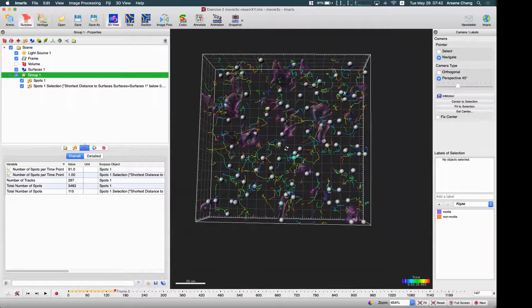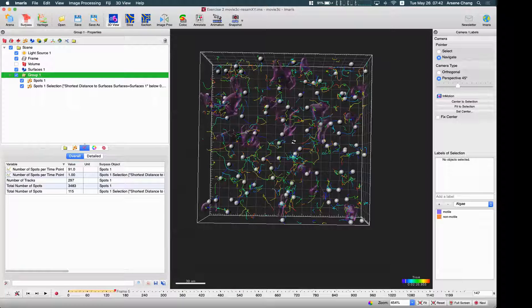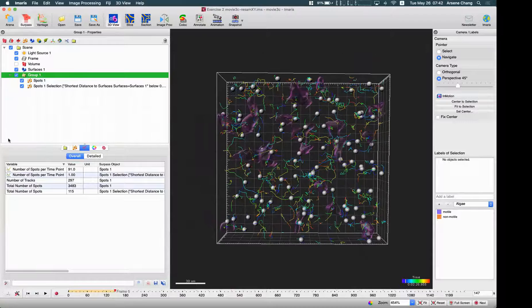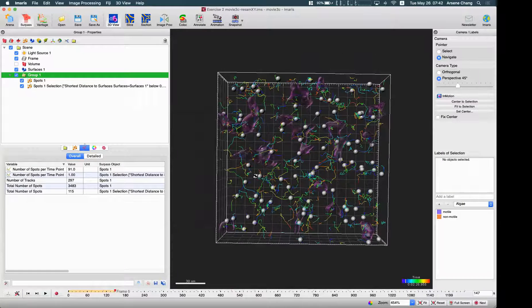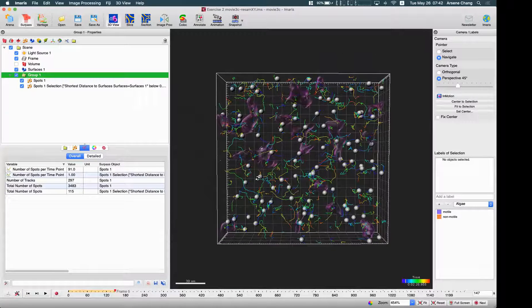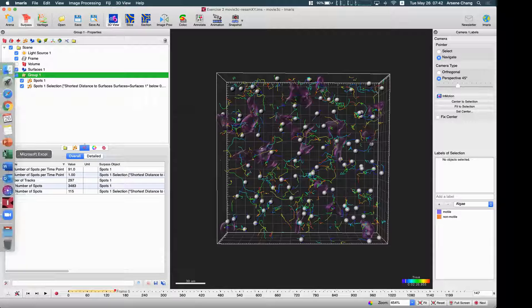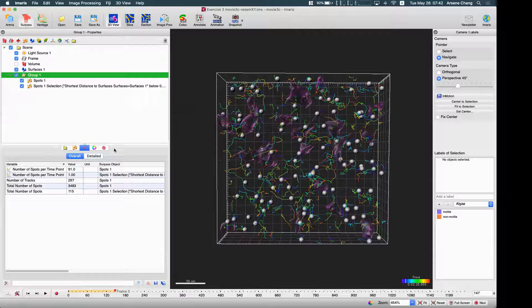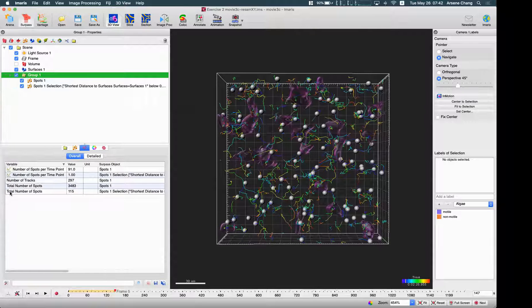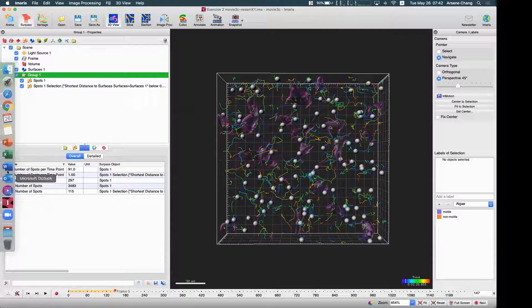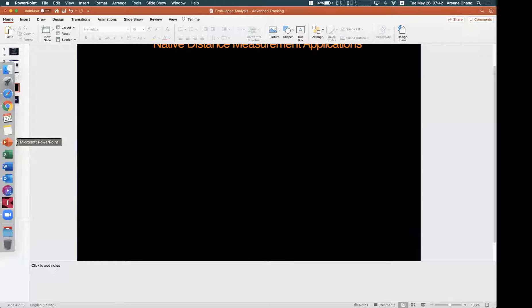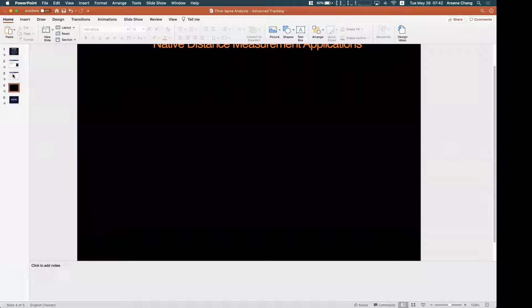So that is how we can use the native distance measurements to filter our contact events and calculate the numbers, or other statistics — whichever is required. That is the shortest distance calculation combined with the tracking.